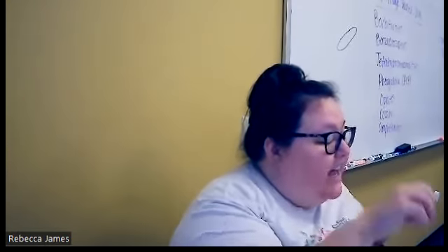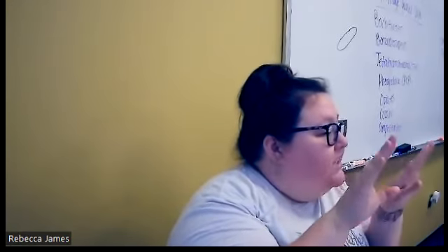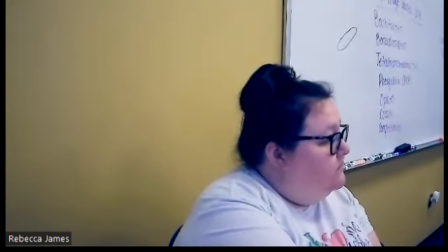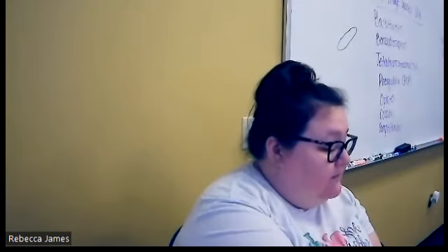And it looks like it's going to open. It looks like it's going to open at the top. It has like a pimple type thing protruding out. Y'all see that? So that's C. sinensis.